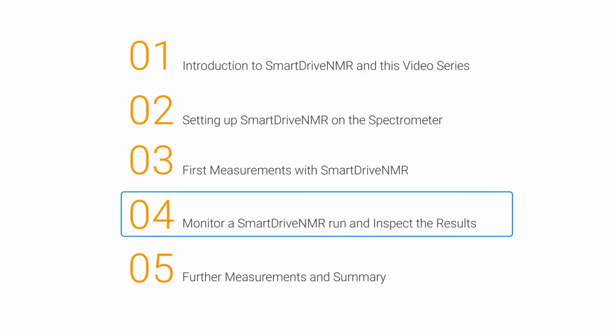Let's get going with our fourth video. In this one, I would like to show you what we have started in the third one, which was about our first measurements with SmartDriveNMR. In this video, we're gonna inspect the results.